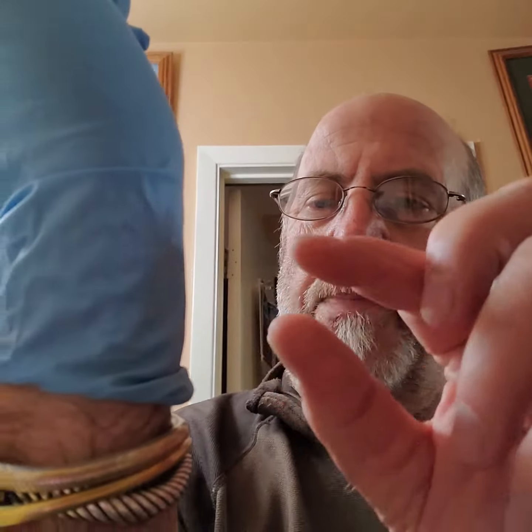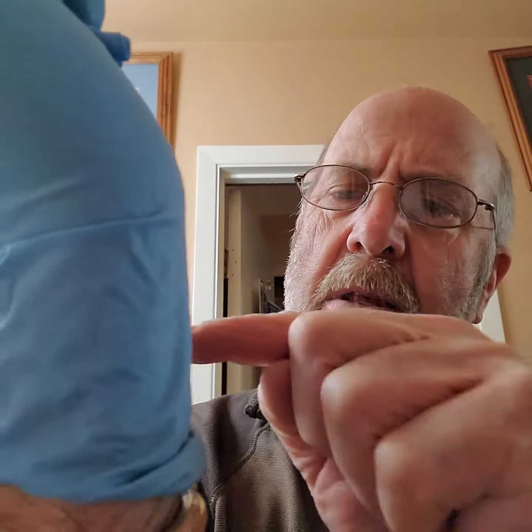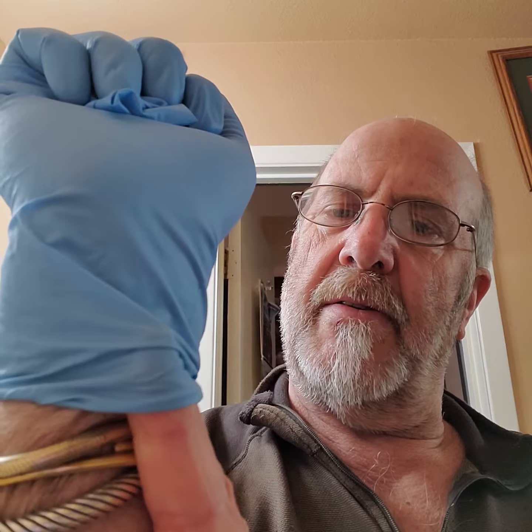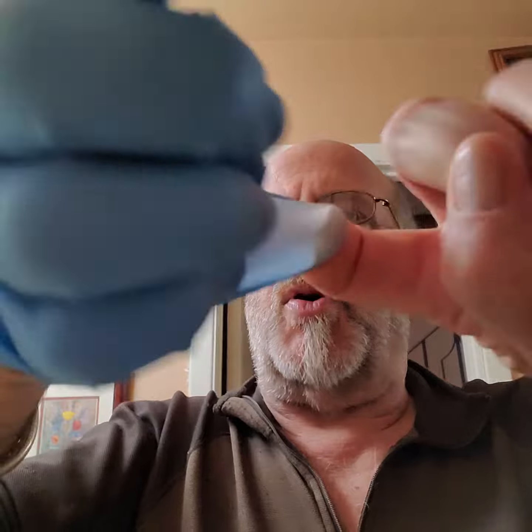Now here's the trick: with your un-gloved hand, you don't want to grab the glove area because it's contaminated. So what you do is come underneath the glove, to your skin, and pull that glove up, touching only the inside.